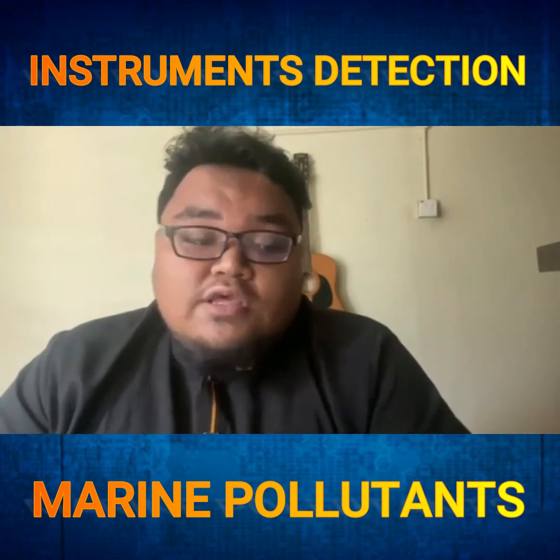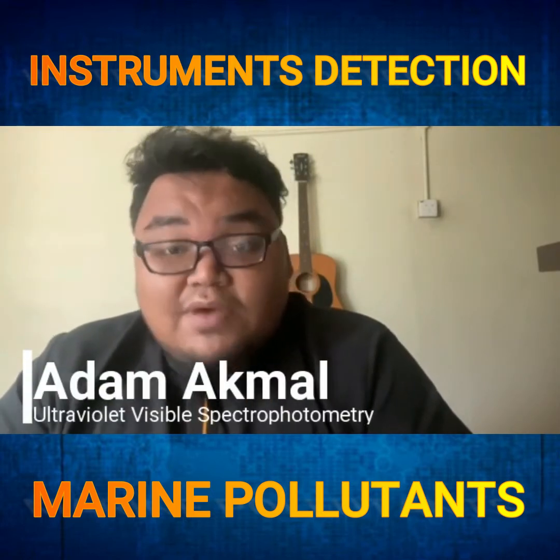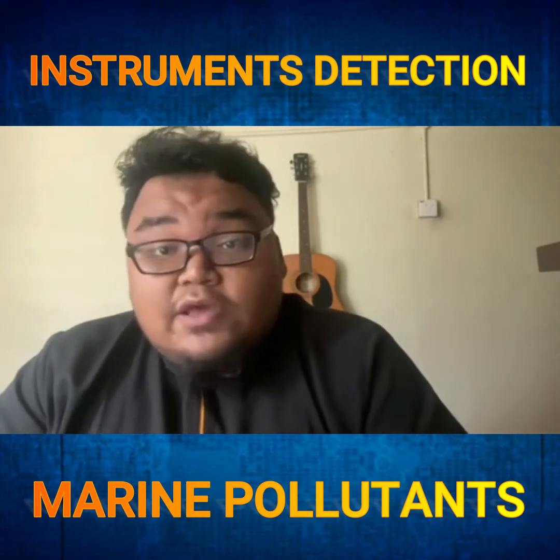Assalamualaikum. So today we'll talk about the ultraviolet visible spectrometer, or you can call UV-VIS spectrometer.